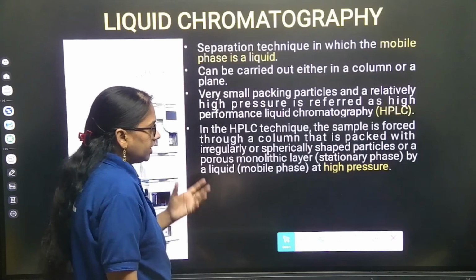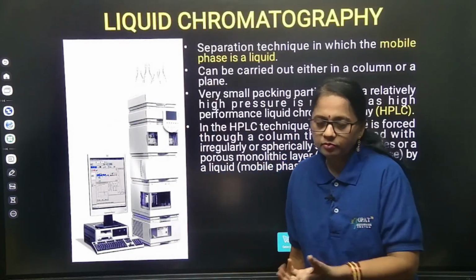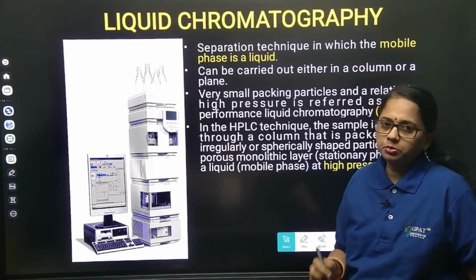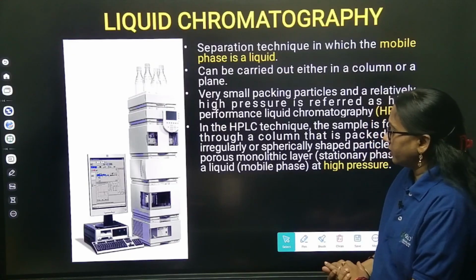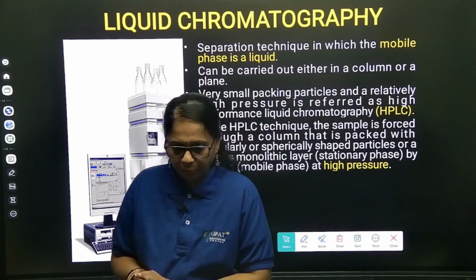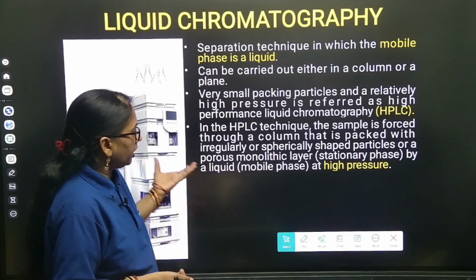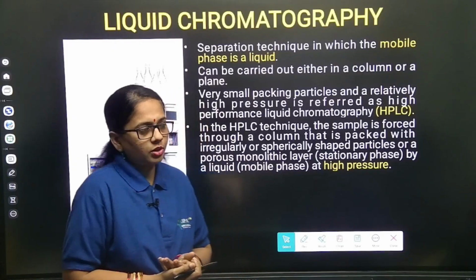And mostly in the HPLC technique, we inject the sample through the injector, and all the HPLC vials are going to be present there. Here the resolution is also very important. The samples are going to be injected manually, and auto injectors are also available.